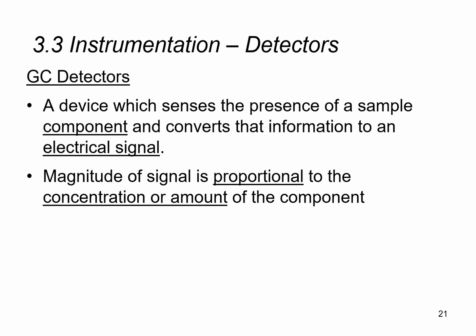We also mentioned that when this detector gives us a signal, the size of the signal or the size of the peak is proportional or indicative of the amount of the component present. So if we have a very large peak, that will tell us that the amount of that component in the sample mixture is very large. If we have a very small peak, that will tell us that the amount of that component in the sample mixture is actually very small.